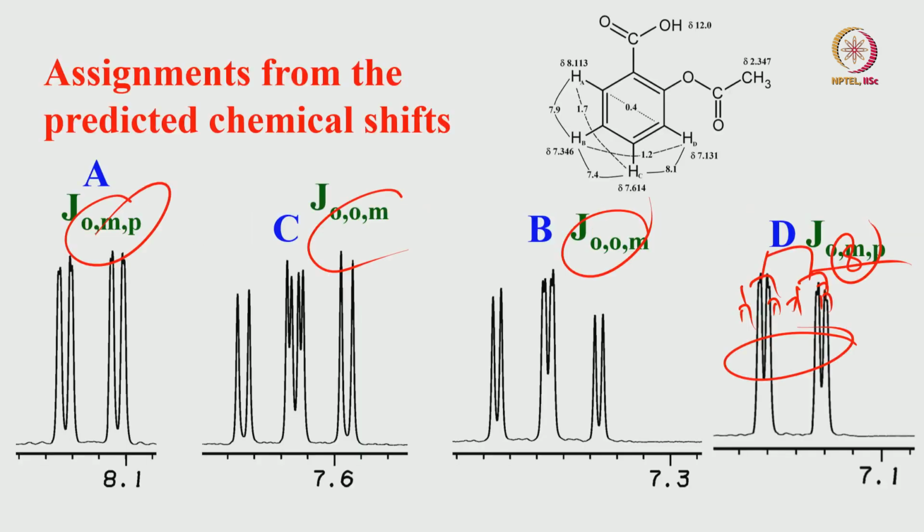So, now fairly you got the idea how we can analyze the spectrum of a simple molecule, with a lot of examples we took yesterday about aliphatic group molecules, only aliphatic groups. I did not take the example of the phenyl group, and based on the multiplicity pattern we made the assignment of all the protons without any difficulty, based on the shielding and de-shielding, where it is resonating, and looking at the multiplicity pattern in the molecule, the group sitting next to it will tell me what its multiplicity pattern is, and I am able to analyze this.